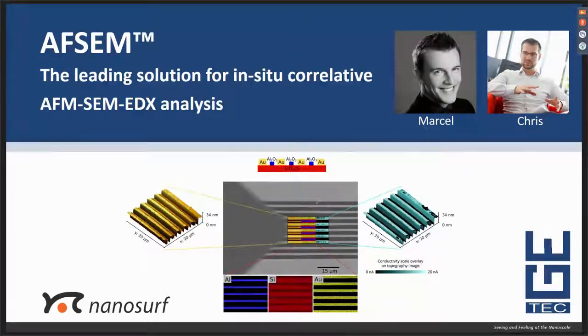After that, Marcel will show you step by step how to perform a true correlative experiment with the AFSEM. Then we will present to you the latest application measurements and close with answering your questions that will come up during the webinar. So I encourage you to use the chat window on your screen and post your questions, and we will then try to answer them at the end of the webinar.